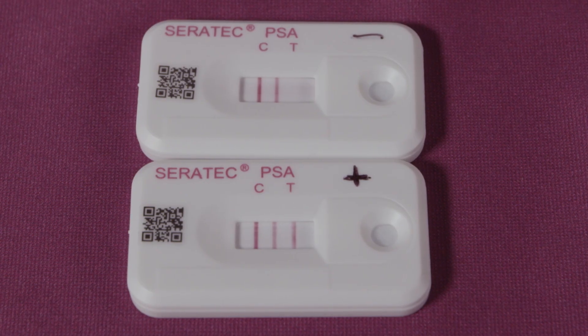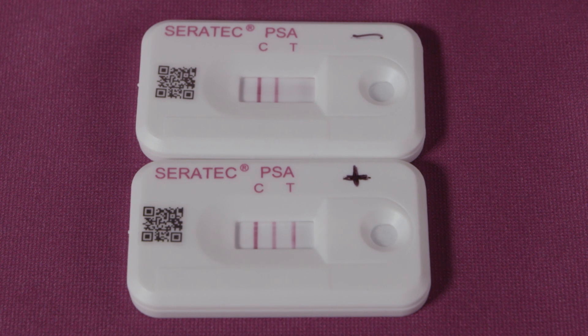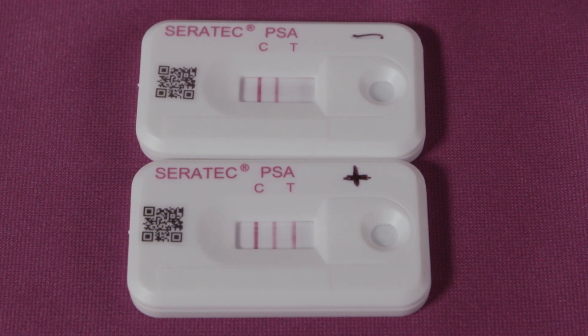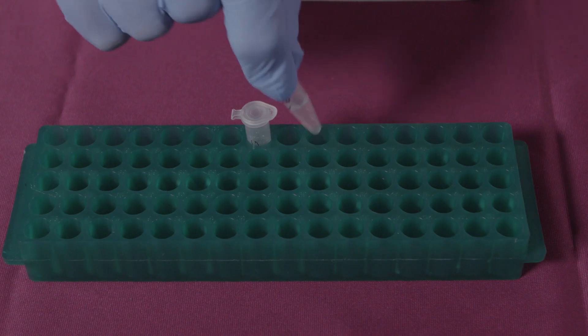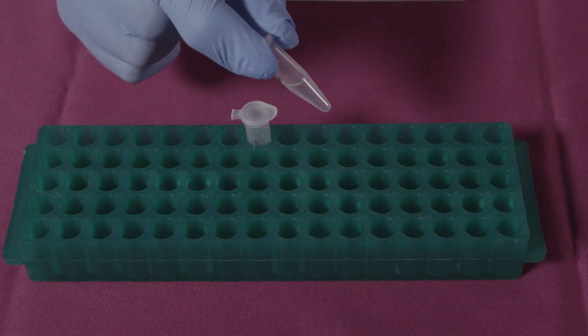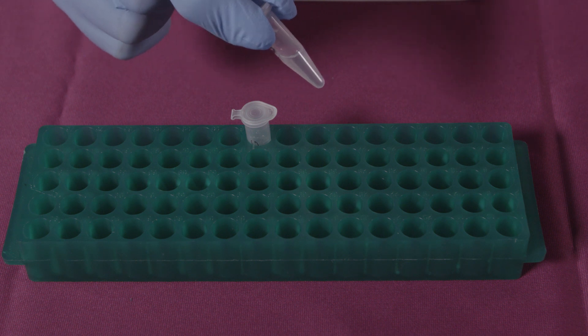A positive result will show three lines. A negative result will show two lines. If the control line should not develop, the result is invalid and the test should be repeated. The buffer is PBS and the remaining extract may be retained for DNA analysis.